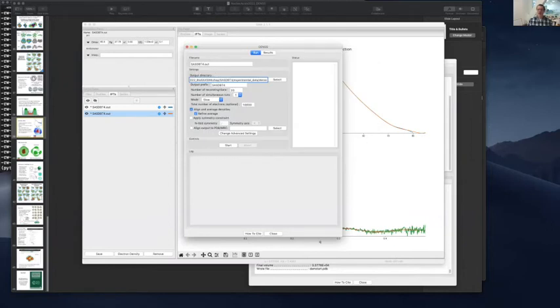But what you want to do is then set the number of reconstructions, which defaults to 20. If you have multiple cores, you can actually run multiple runs simultaneously. I think I screwed something up on my settings, so it's not showing up, but you can run however many cores you have. There's a few different options for the mode. If you want to do the default, it's slow. You can also run fast, but to be honest, it's pretty fast as it is. It only takes a few minutes for this to run. So I'd recommend slow. If you would like, you can also do membrane mode.